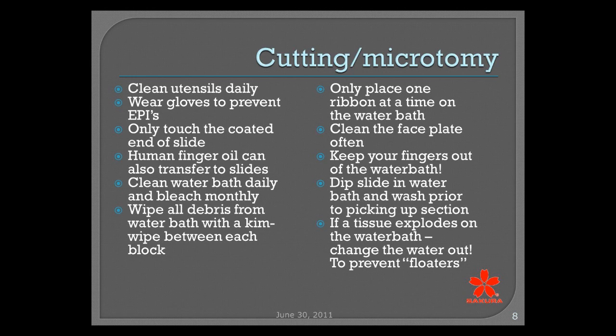I also always train my techs, if they have bleached their water bath, when they put it back onto the heating element, to flip it upside down. That way the next person that comes behind them will know that it was bleached the night before or by the person who was just at that microtome.